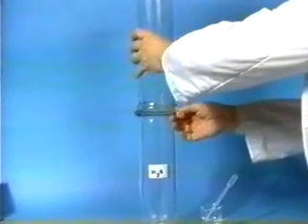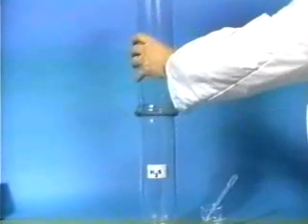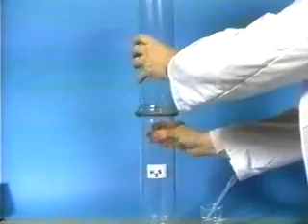Then we remove the plate separating them, so that the two gases can mix. We note that on removing the plate, the H2S and sulfur dioxide do not react. No change is observed.